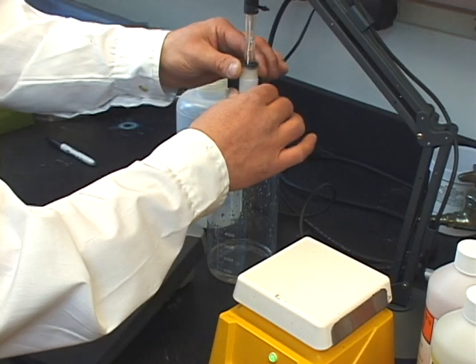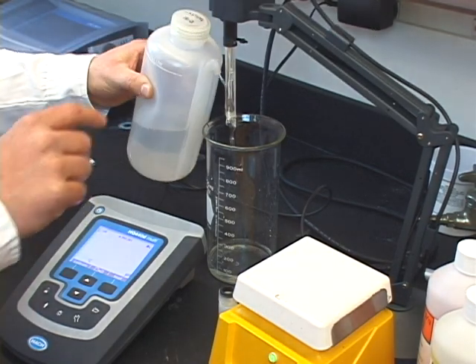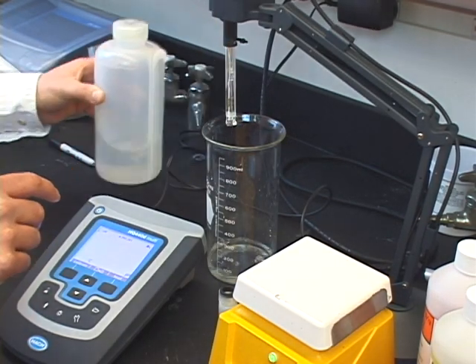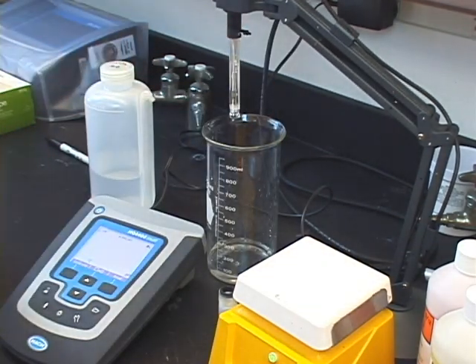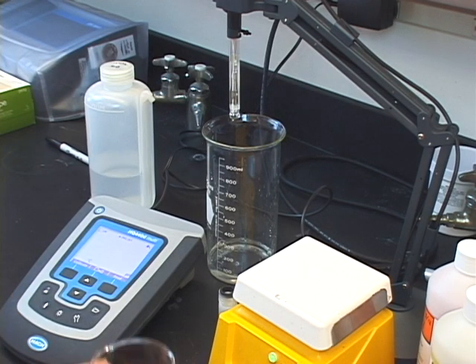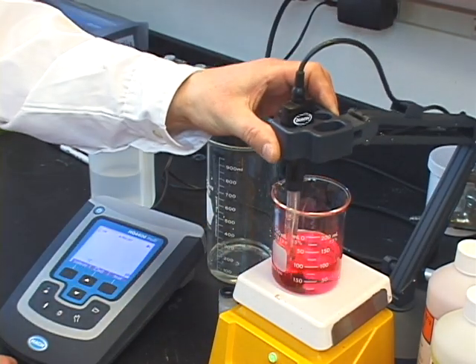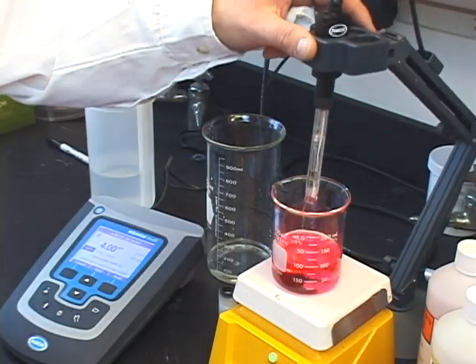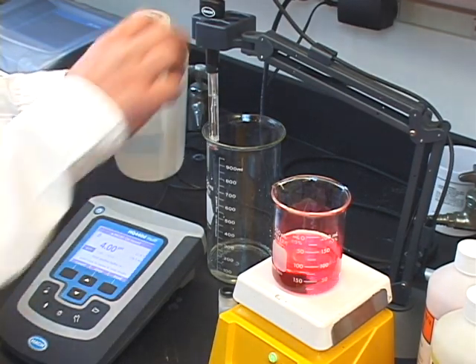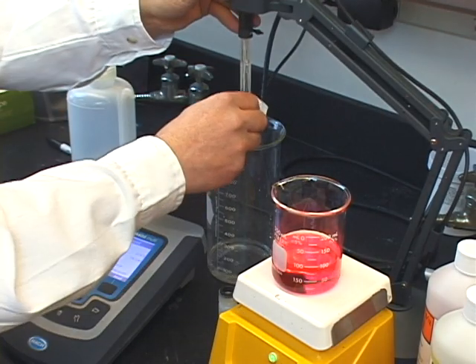Next, remove your electrode from its storage solution and rinse it in deionized water. Once it's rinsed, blot the electrode. Be sure not to wipe the glass bulb, as it could influence our calibration and measurement. Once the electrode is rinsed, follow the prompts on your meter: immerse the electrode in the buffer solution, press calibrate, remove the electrode from the buffer solution, clean it with deionized water, blot any excess liquid from the bulb, and repeat until you have calibrated with all the required pH buffers.